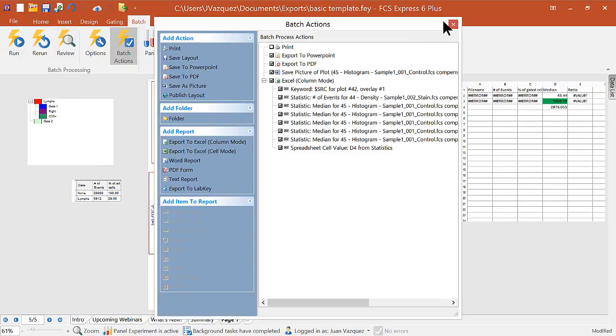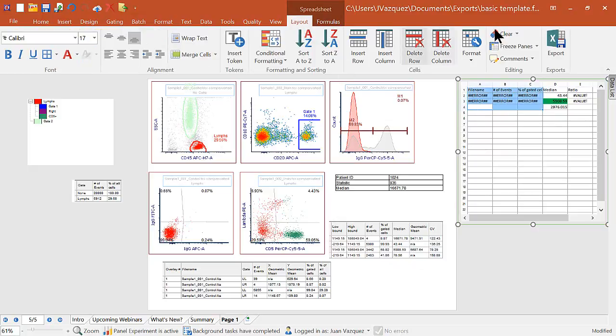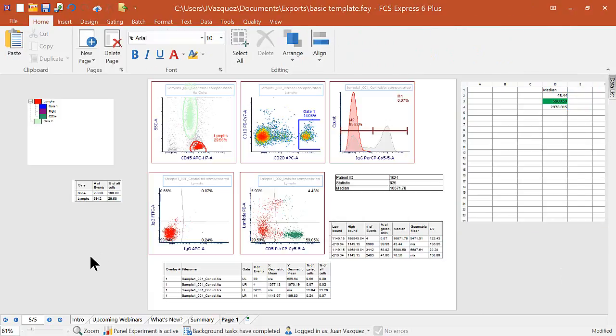Okay, so our spreadsheet is showing some of these errors, but that's just because of when we first dragged and dropped all 4 of those files that were in that data list. So that's fine, because right now we're just working with the context of these medians, which we dragged and dropped directly from this table here, so we don't really care about these. If I wanted to, I can select all these and clear those out if I need to. Same thing with these ratios. I'm not really exporting them, but that's okay.